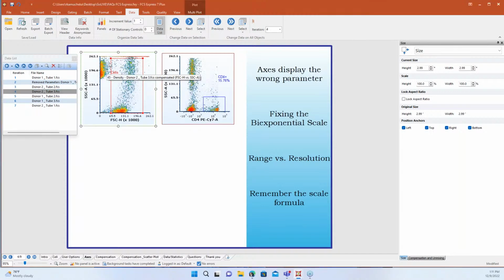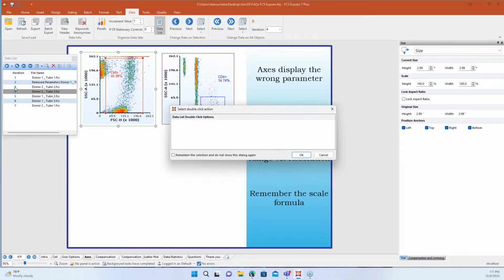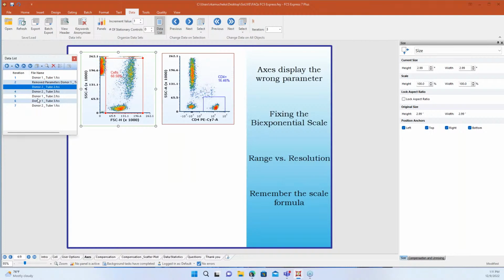Now, if I extend my gate, I'm going to make this a little wonky intentionally, just so I can show you this shift a little bit better. So here we have 10 to the -4 on this X parameter. When I go back to my third iteration here, you can see that it's 10 to the third, and I'm like, oh, Robin, I really need my data to look consistent across these things. I get that. We get this question a lot: how do I fix this scale so it's not bopping around from sample to sample?